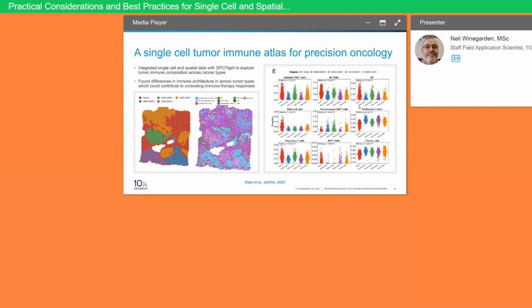Taking this information, Nieto et al. applied the Heyn lab's SPOTlight pipeline to deconvolute each spot of a Visium transcriptomic assay. On the left side of the left panel, you will see the spots colored by gene expression signature. So we have fibrotic tissue, HER2, or ESR status.